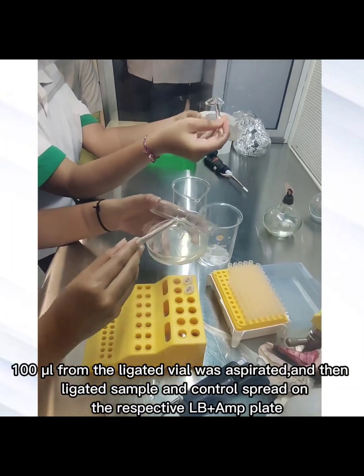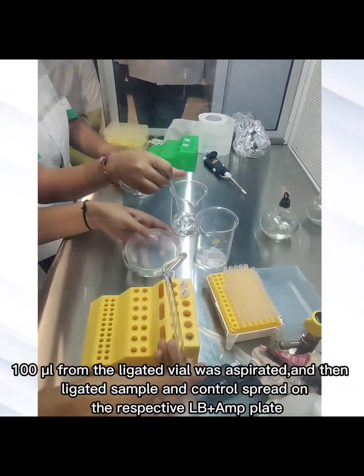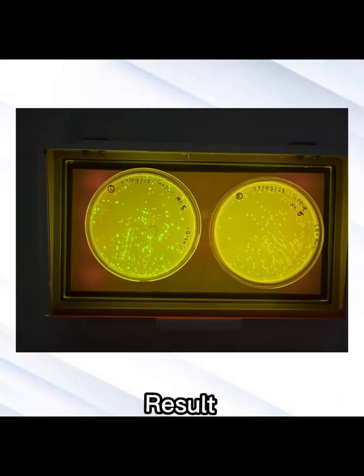Keep both plates in an incubator at 37 degrees Celsius for 24 hours, and after 24 hours, observe the plates under a UV transilluminator. Result obtained from the UV transilluminator.